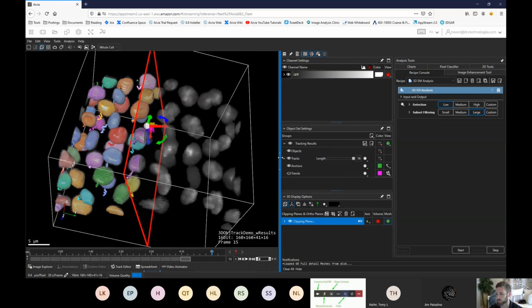And like Jim said in the chat just now, another thing is that this red highlight of my clipping plane and this widget here. This is useful when I'm interacting with my data, but if I want to save a screenshot, it's not useful in the screenshot at all. So I want to hide that. It's not obvious how to do that.